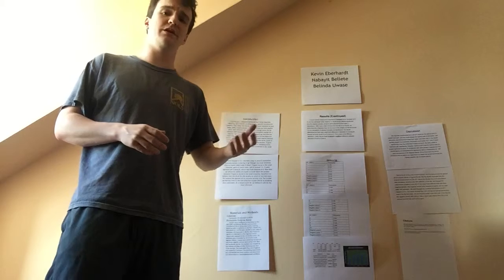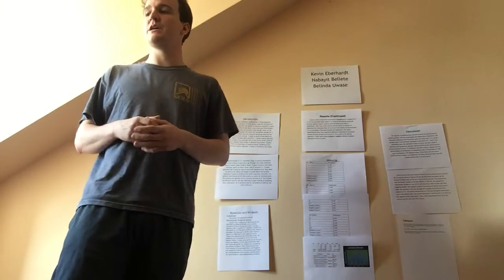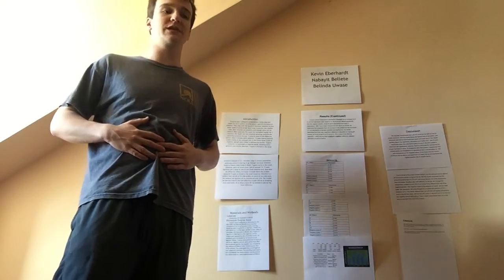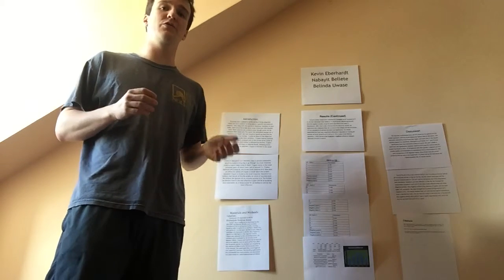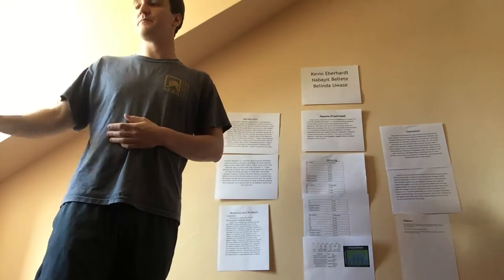To catalyze the hydrolysis of proteins. And our hypothesis was that it would be at a pH of 8 because that is the pH of our small intestines. So higher than 8 and lower than 8, it would not be as effective at breaking down proteins.